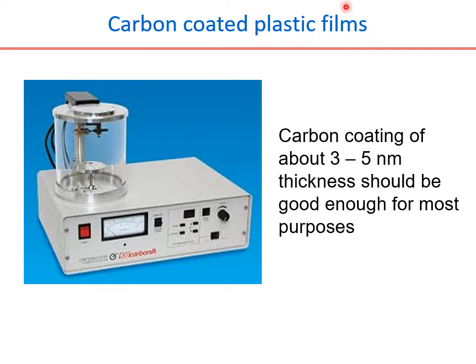So if the protein is not able to make a firm contact on the plastic film, that will compromise the stability of the sample on the plastic film. So in order to improve this, some people prefer to go for a carbon coating on top of it. Carbon coating being rough in nature can give us better adsorption of the sample. So that's the reason why we go for carbon coated plastic films.